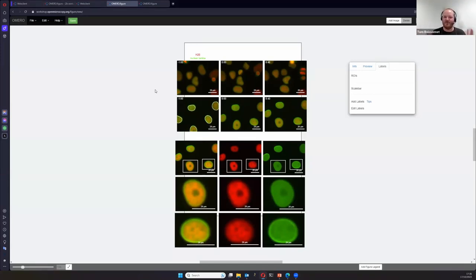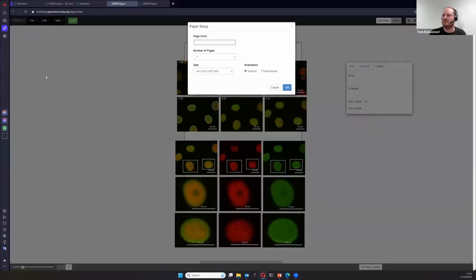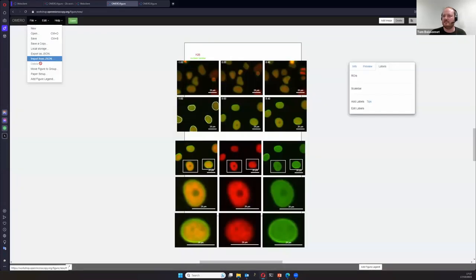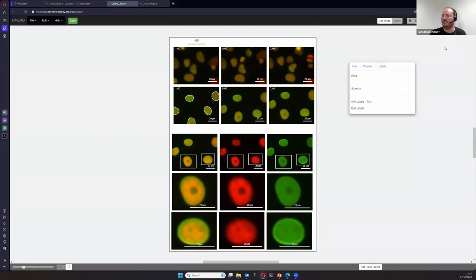Will it maintain layers in Inkscape, including the scale bar? The scale bar should also be editable if you export as PDF. So let me try: File → Paper Setup → Crop Page Around Panels to have just the view I need, then export and download the figure. I can open that with Adobe Acrobat and use 'Edit Text and Images' to add text, change the font, move labels, and change scale bar properties — though of course don't change the actual size of your scale bar.